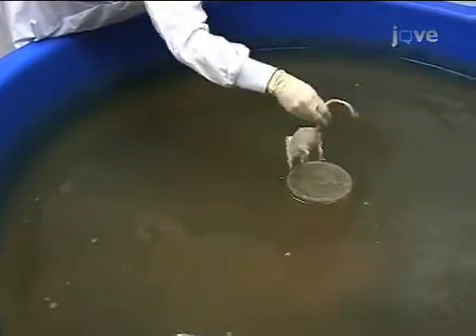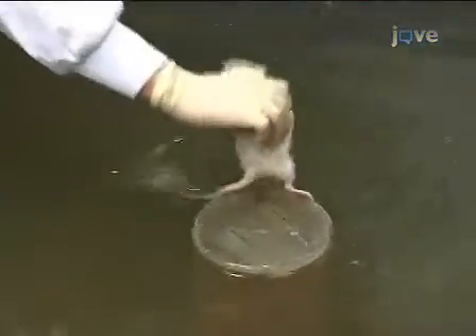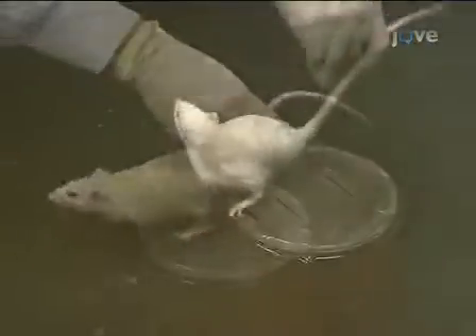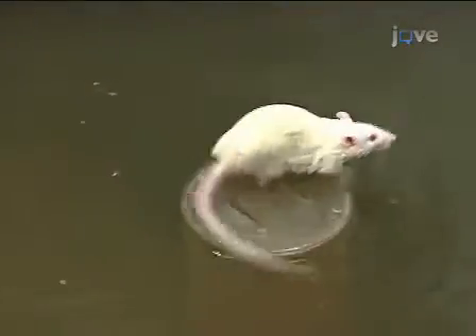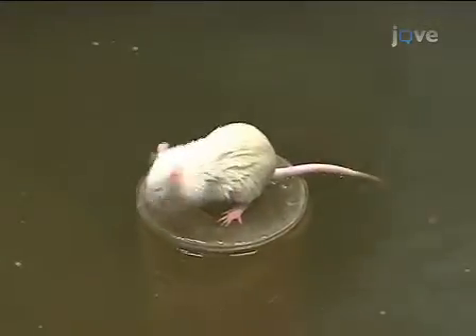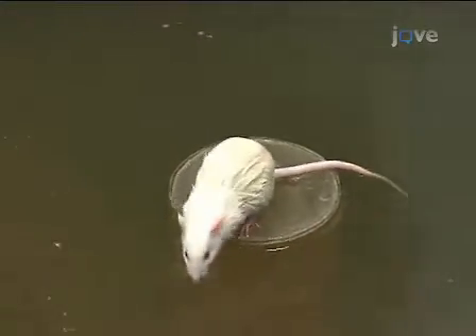Let the animal sit for 15 seconds. If it falls or jumps off, gently guide it back. This will train the animal that it must stay on the platform to be rescued from the pool. Repeat the same procedure for two more trials, starting at a different location for each. Once the animal has completed all three trials, dry it off with a towel. Repeat the three-trial training process for all the animals, keeping the directions the same for all of them and recording their time.